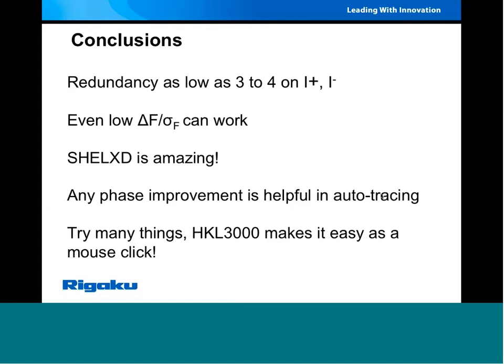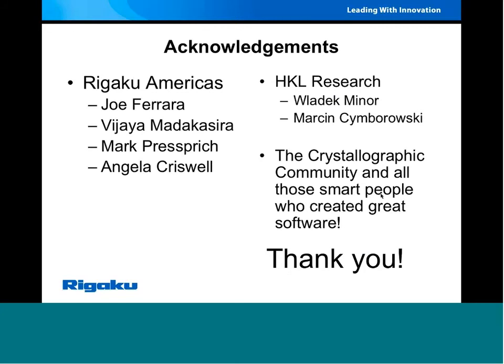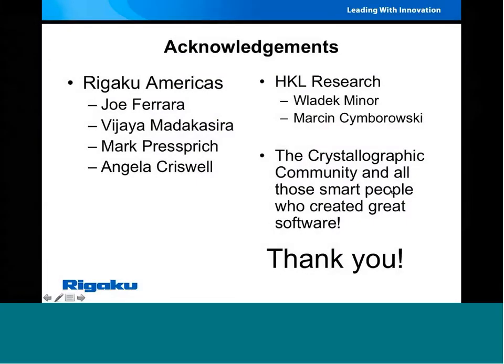HKL3000, the graphical user interface, makes it as easy as a mouse click. I want to thank my colleagues again, and I want to thank you guys for watching. So I think I'm ready to take a few questions.